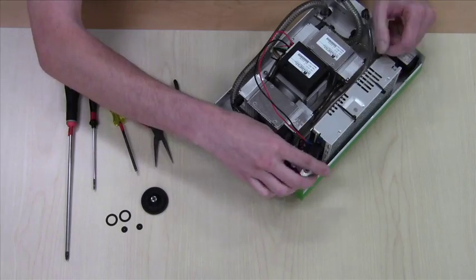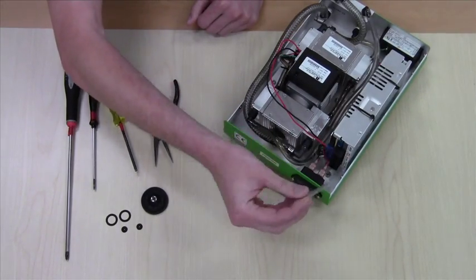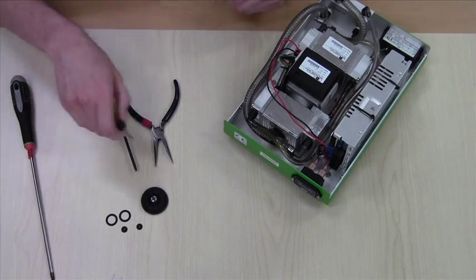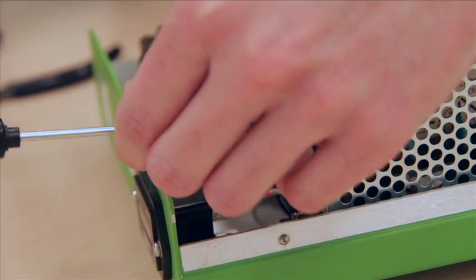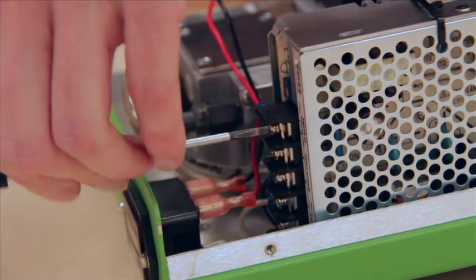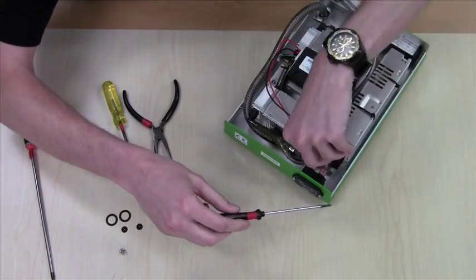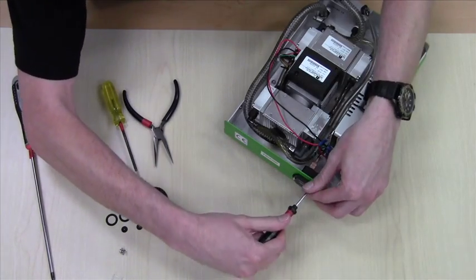We'll begin by going to the power supply and removing the protective cover. We'll take a Phillips or a flat head screwdriver and remove the first terminal — simply unscrew it. That's the positive terminal. We'll be removing the negative.